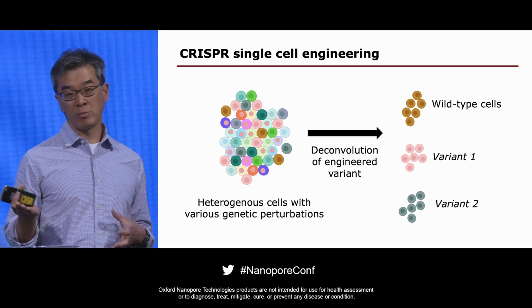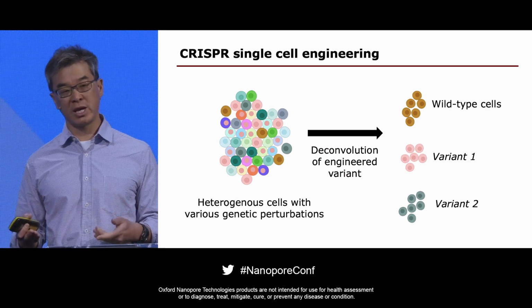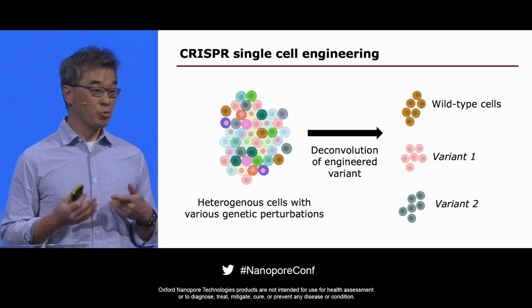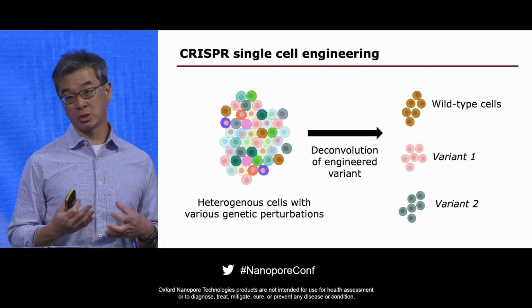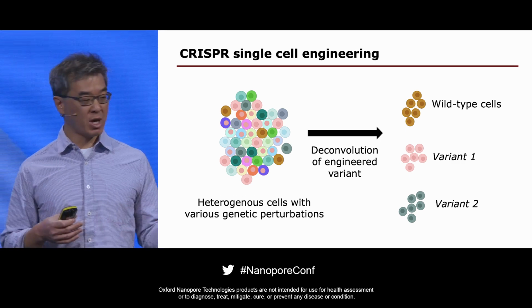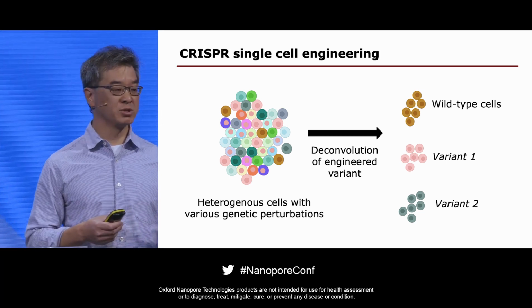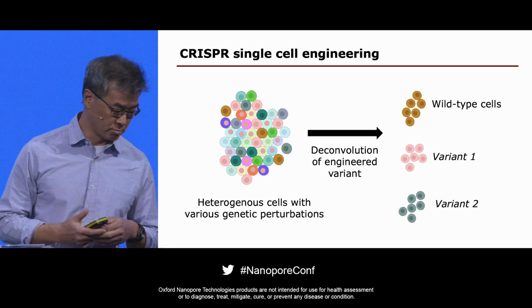Secondarily, we are all aware of CRISPR single-cell engineering, which really provides opportunities to increase the scale of phenotypic assessment of different types of variants. And I'm going to demonstrate some methods where we can do that, which really leverage long-read applications. By doing this, you can assess variants across a great number of cells. Individual experiments that could have taken months, many plates, get reduced down to a single batch. And I also think this offers opportunity, particularly when combined with selective growth advantage or other types of selection conditions, to actually use it to start engineering the context of cells.